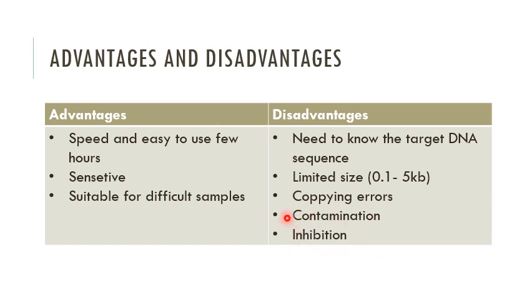The contamination will result from contaminated template DNA, contaminated surfaces you work at, and even contaminated tools you are working with. Let's say the pipettes: you use the pipettes in a certain area, and then you pipette your PCR components with them, so you will carry over some contamination like extra template DNA or bacterial contamination.